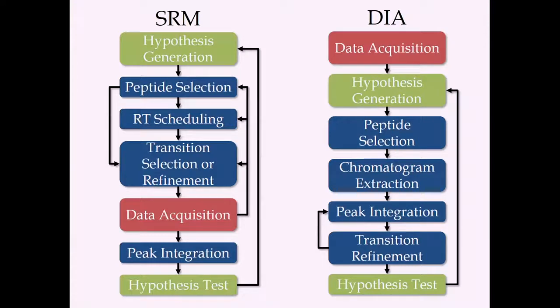Because one of the reasons we got into this is we would have a huge collaboration with somebody, and we would build a set of peptides to measure, say 100 peptides, in, say, 100 different samples. And then the first thing their collaborators would say is there's a brand new protein that someone said may be important in this case. Can you go back and rerun those samples again, measuring this protein? So what is kind of nice is that in theory, you can collect the data once, and you can go back and actually have your collaborators reanalyze the data themselves with some training or knowledge about this.